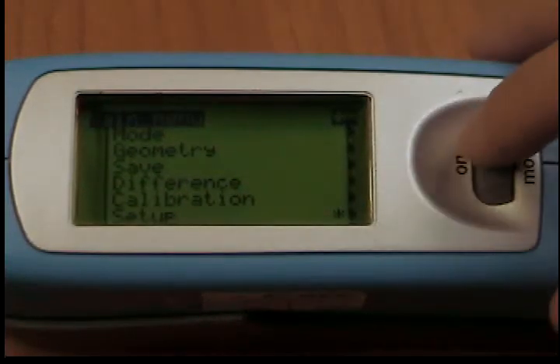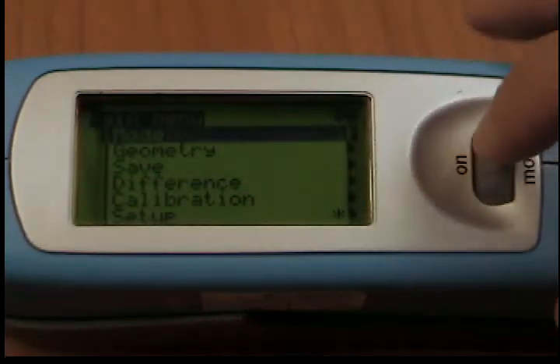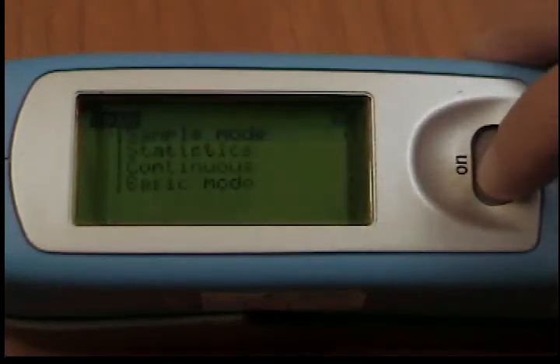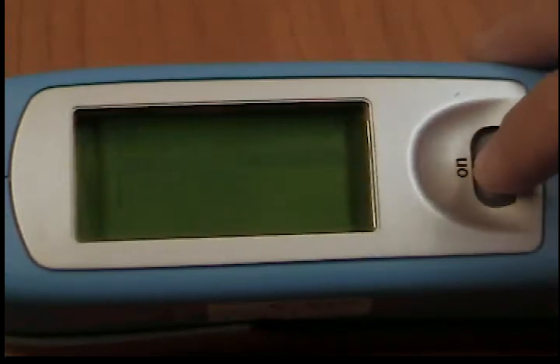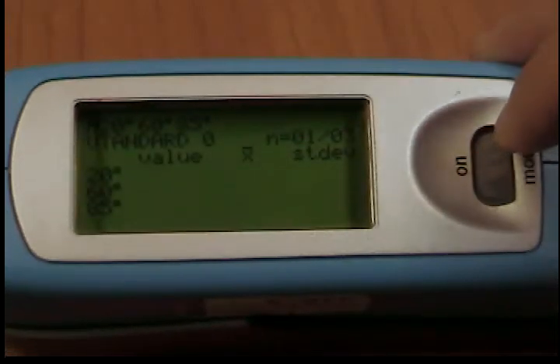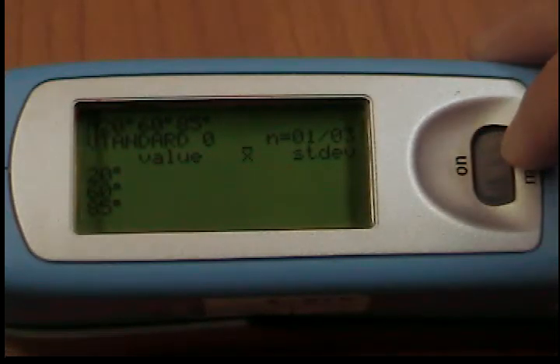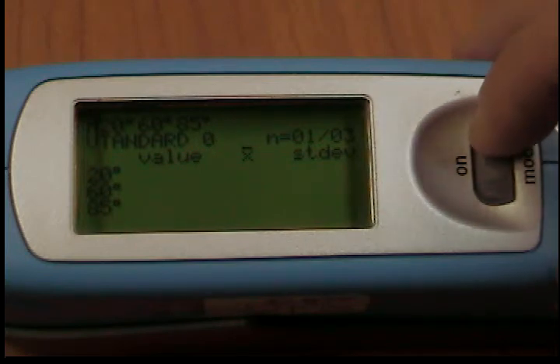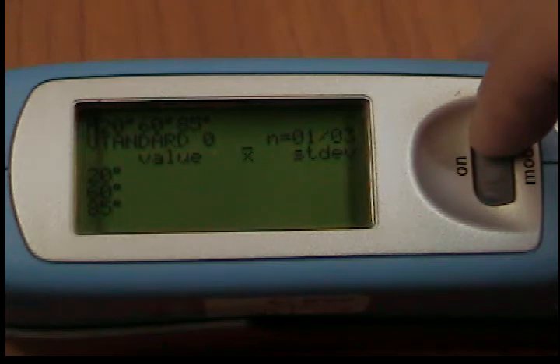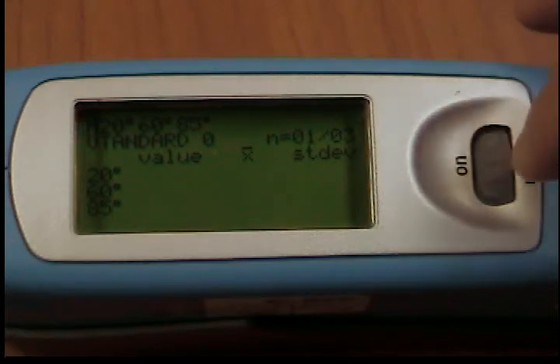Using Statistics Mode on your Micro Trigloss Gloss Meter, you can make multiple measurements with each sample. These measurements will be evaluated statistically and displayed. The results can be saved and compared with a reference. These functions must be previously activated.